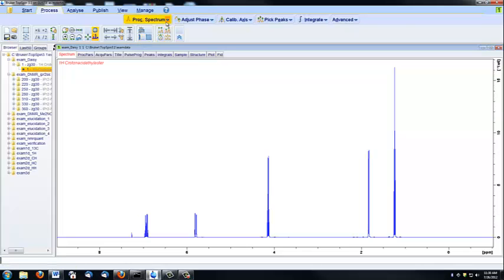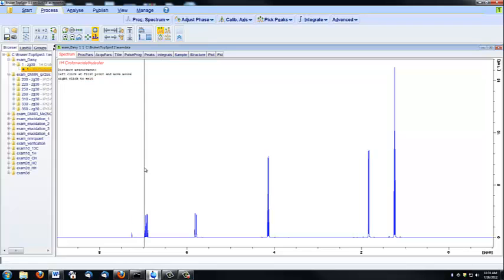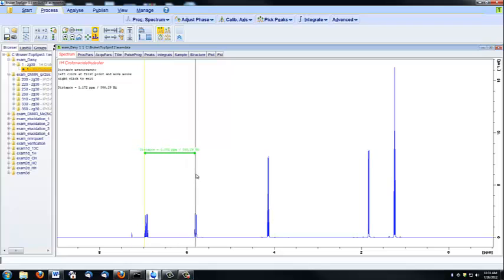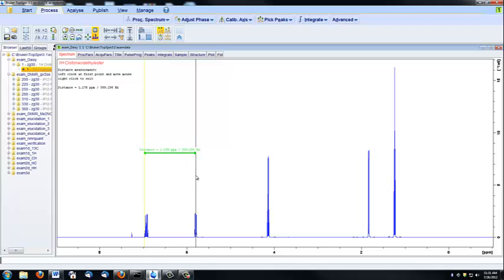If you want to see how far two peaks are away from each other, you can start a distance measurement. And by clicking and then dragging, you can see exactly how far two peaks are away from each other.